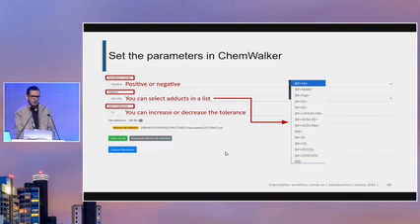If you obtained the MS data on equipment with higher resolution analyzers such as TOF or Orbitrap, you mustn't increase the tolerance above values of 10, 15 or 20, because you must keep the high resolution, and you must choose the predictions that present the exact mass close to the observed mass to keep the high resolution and increase the confidence in the annotations.